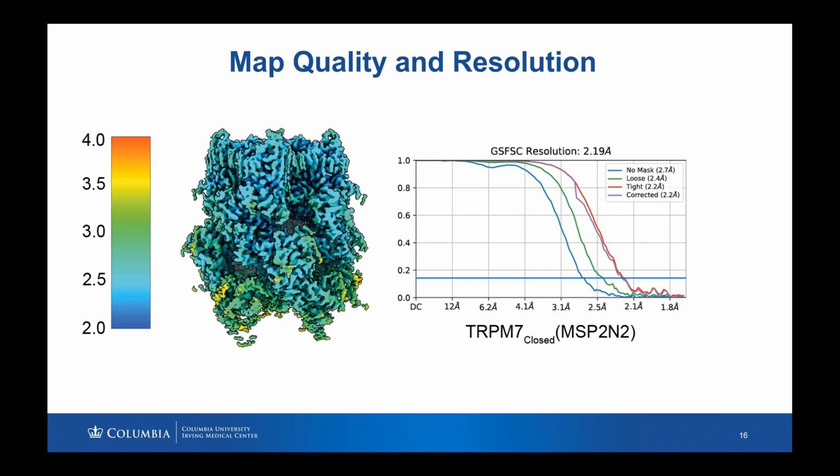So that's why I prefer to still use RELION. And back in those days when we started those projects, the 3D classification in RELION worked much better than in CryoSPARC. Although CryoSPARC now, they're close. I think they're even in 3D classification right now.